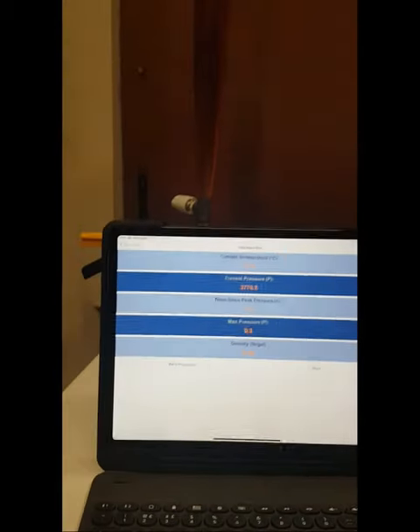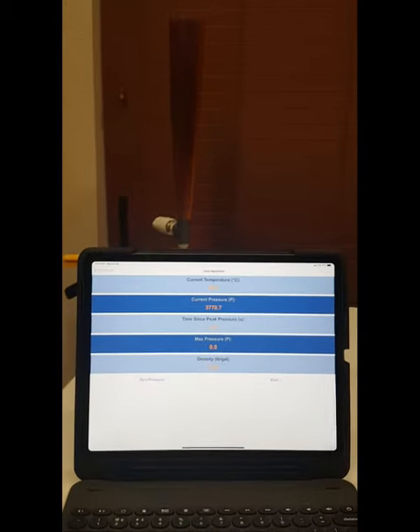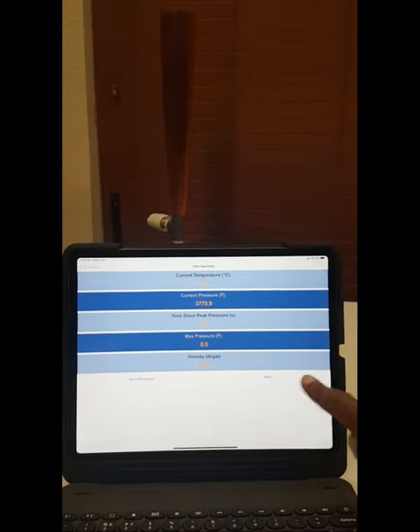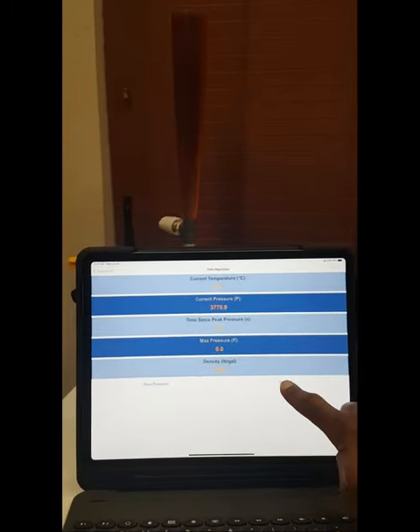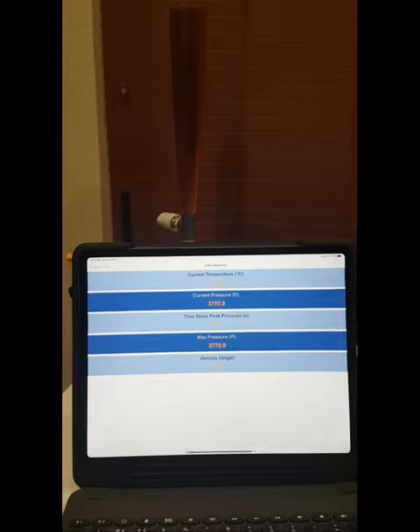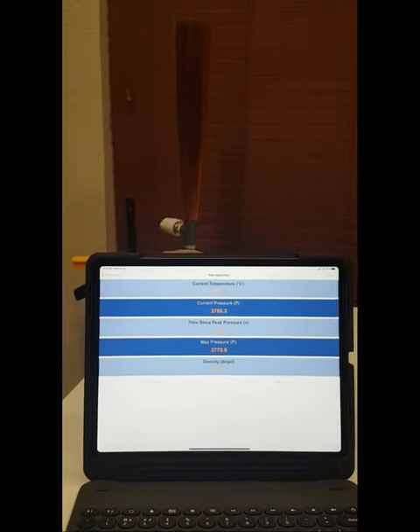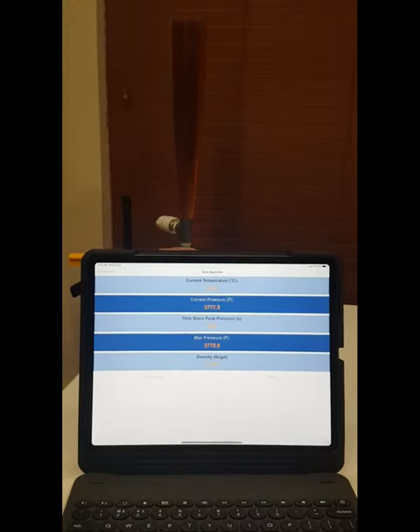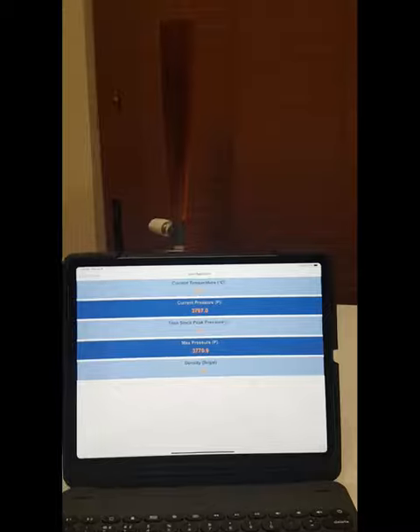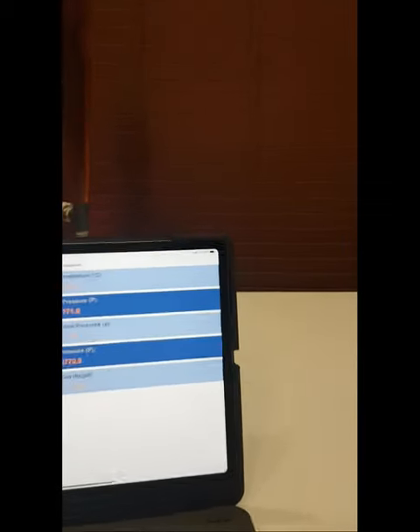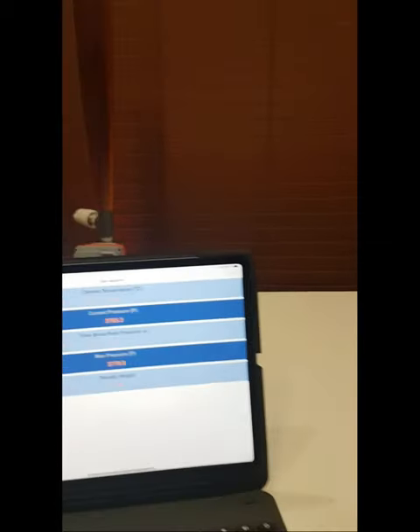The Goblet Viscometer and Thief Goblet app can be used to quickly measure a wide range of fluid viscosities and densities. In this video we will demonstrate the measurement of the density and viscosity of engine oil.